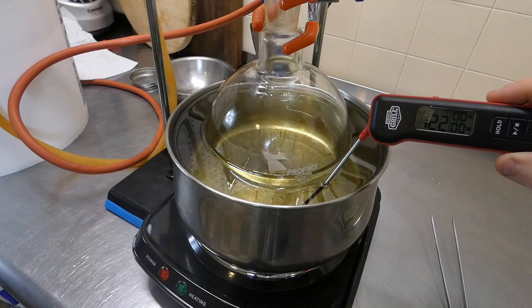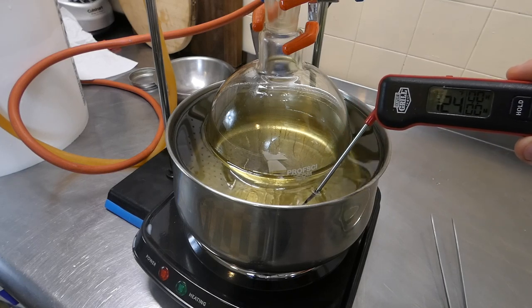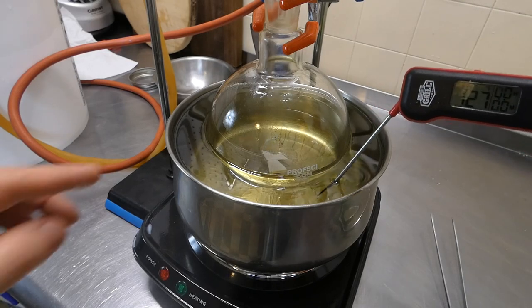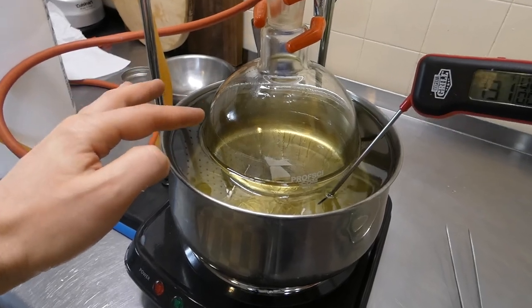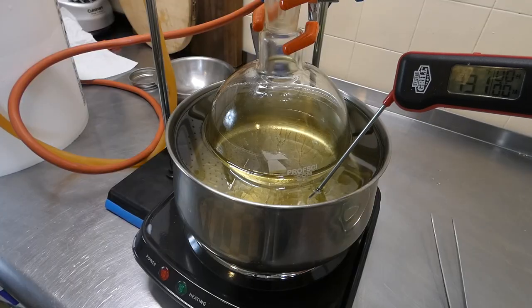All right, so we're just sticking a thermometer in here, monitoring how far it's getting. We're at 124 degrees Fahrenheit right now. You can start to see, I'm not sure if you can see on the camera, but I can see some vapors starting to form on the top part of this flask. That's a good sign.